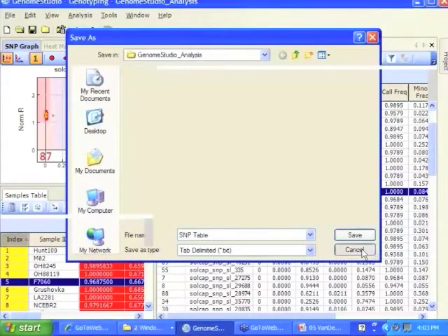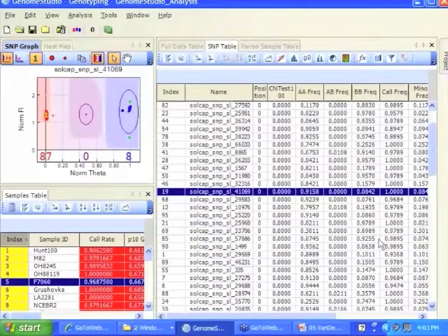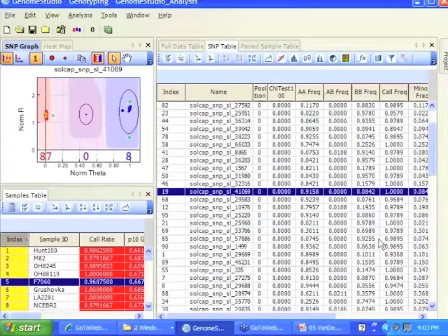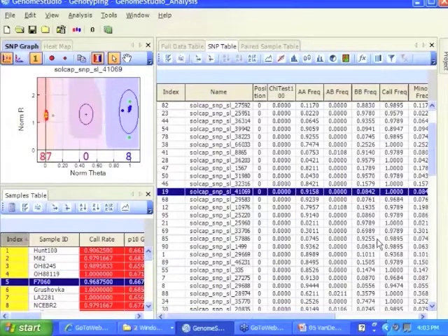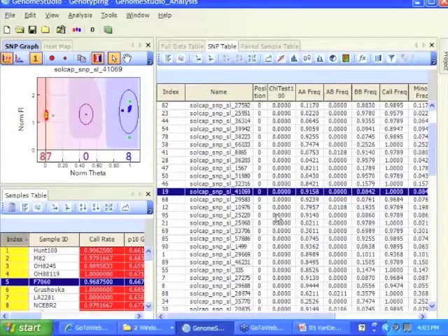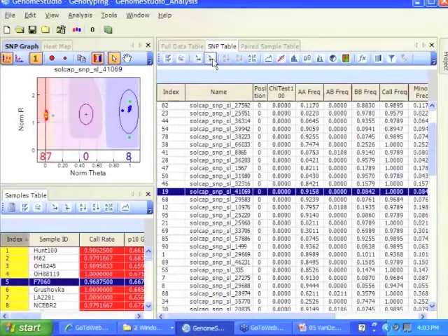First thing you want to know is this really the data I want to export in Excel. So I cancel the number. I'm hiding a bunch of columns here, so I've limited to the columns that I really want to export that I'm interested in. Of course you can delete those in Excel later, but you can just do it right here in Genome Studio.